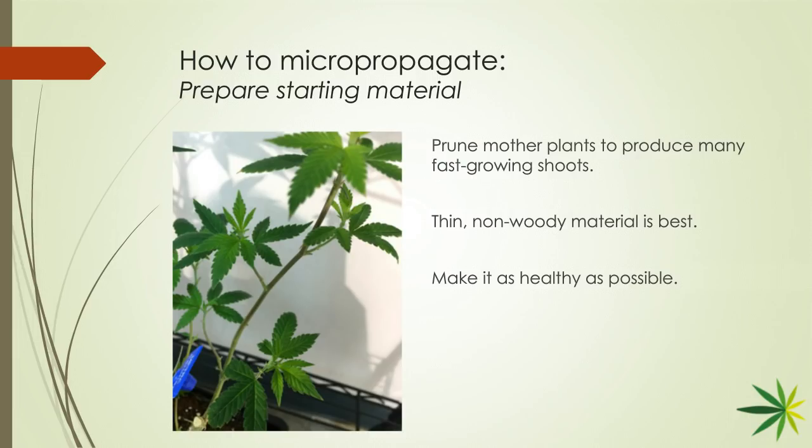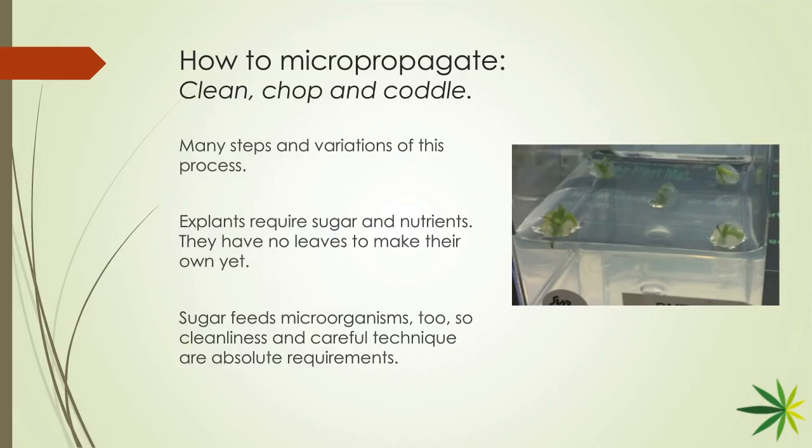So for a while they're small and in this encapsulated state that you see in this figure that I've reused here, you've got to feed them some external carbon. That's in the form of sugar. That's useful. It's a good, efficient food source. It gets them started. They can unfurl their own leaves and begin making their own food. But at some point, the sugar becomes a problem of its own, and I'll talk about that in some future steps. But the sugar is an opportunity and a challenge. You've got to feed it to them. That is a universal requirement for this method, regardless of your variations that you use.